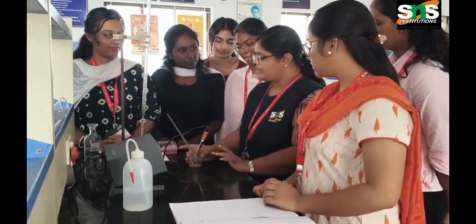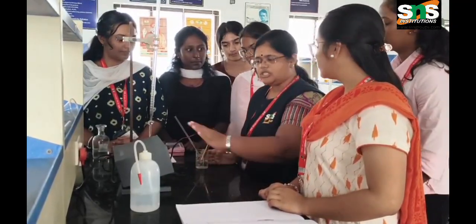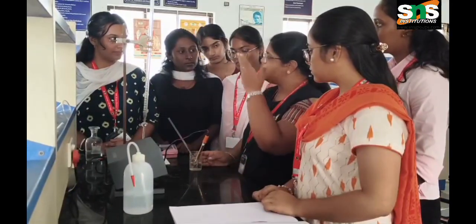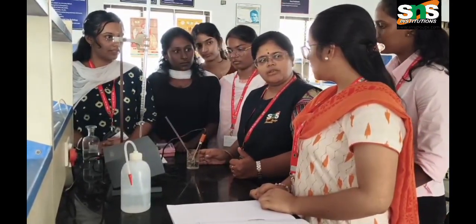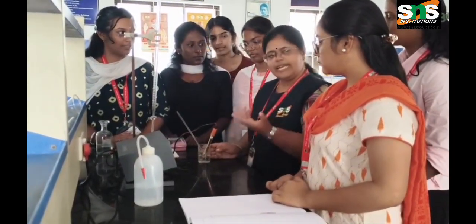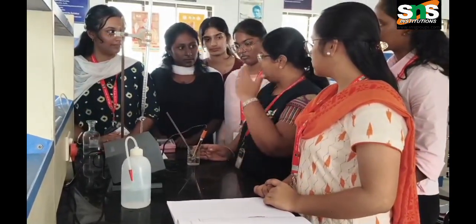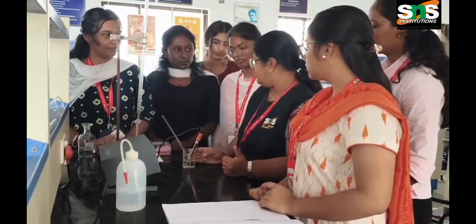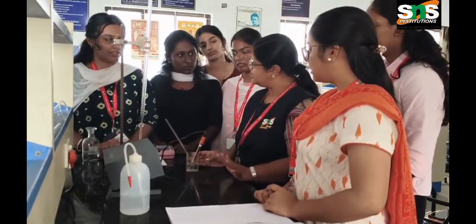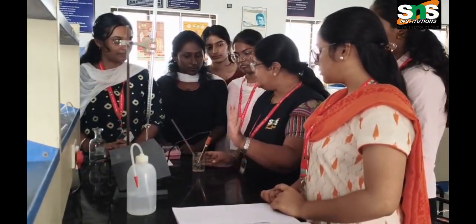Now we are going to find the strength of this strong acid and weak acid using conductometric titration. In the conventional method, that is volumetric analysis, how do you do the acid-base titration? You add an indicator. Which indicator? Phenolphthalein. By the color change, you find the end point. So why do you use a digital meter here? To get accurate results.